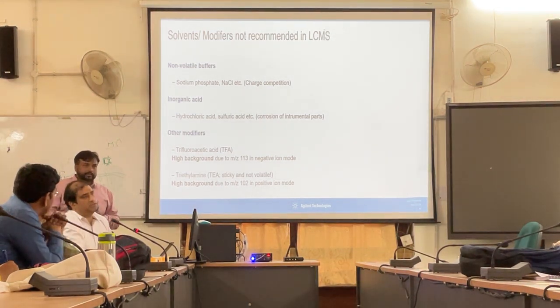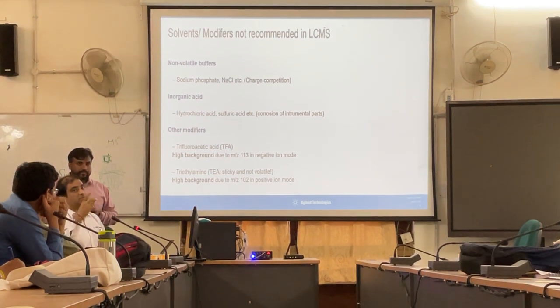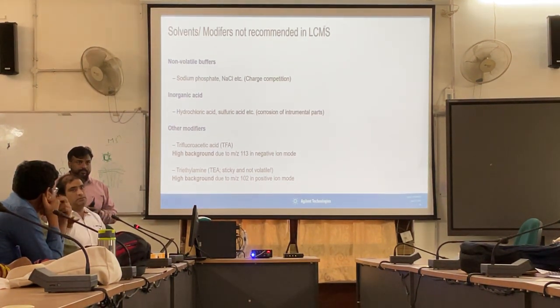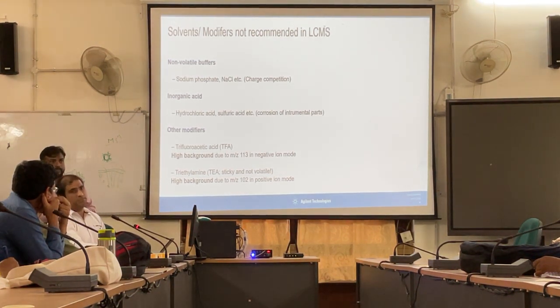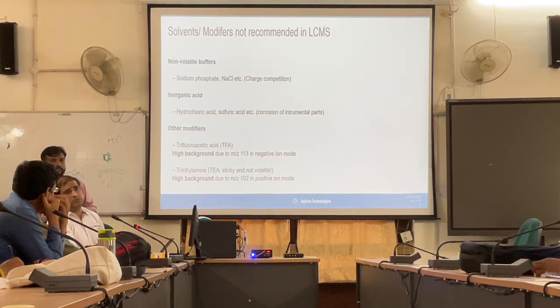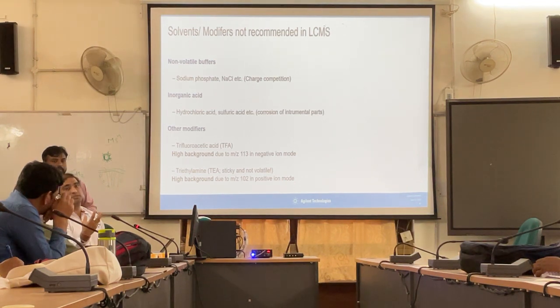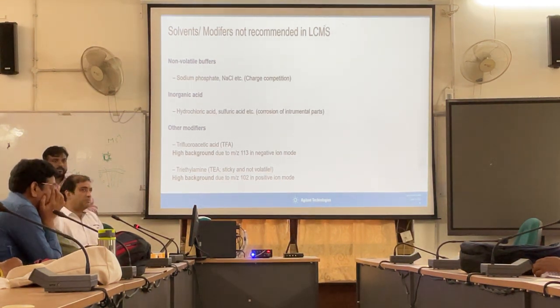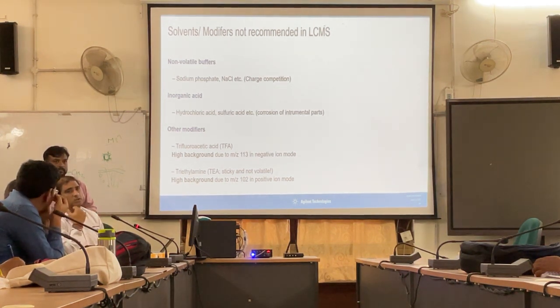See, triethylamine as an analyte that you put in the sample, that is the reason you have an LC. In LC it will bind to a column and elute at a particular RT. So you know that this triethylamine is coming at that particular RT, and your analyte of interest is coming at some other retention time. That is the purpose of LC. It will not allow the mixture to be detected; only one peak after the other will come. So triethylamine will repeatedly come at a particular RT, and you can ignore that peak.